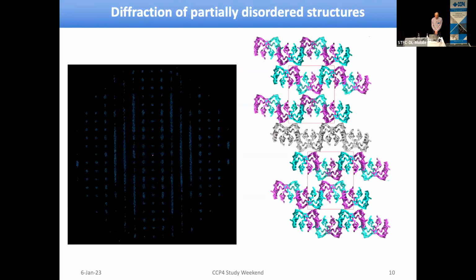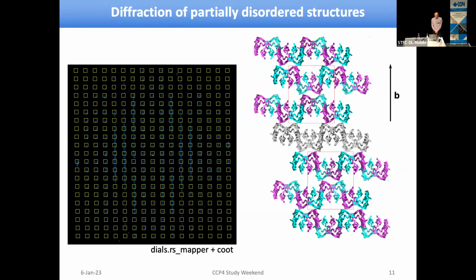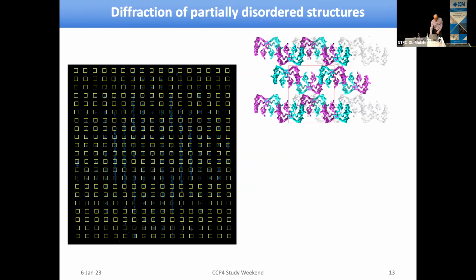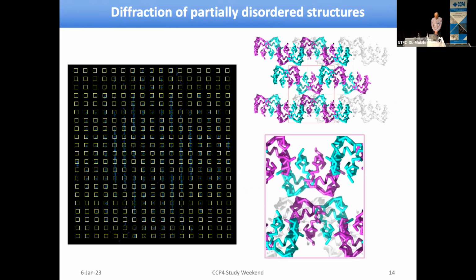When we process our raw images, we assume certain translational symmetry and integrate intensities around corresponding Bragg spots. By doing so, we do reinforce that symmetry, and in effect, we average electron density within the ordered domain and around them, and then averaged over all ordered domains. Let's see what this procedure will do to our crystal. Averaging of the top domain by crystallographic translations changes nothing. It has that symmetry. Including the lower domain gives this. Domains can have neighbors with opposite offsets. Therefore, averaging over all domains gives this.